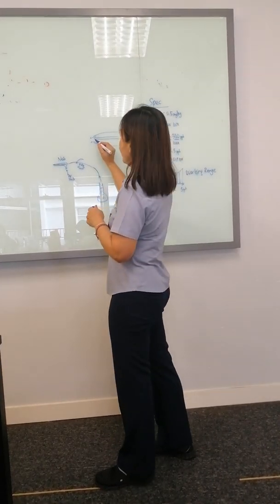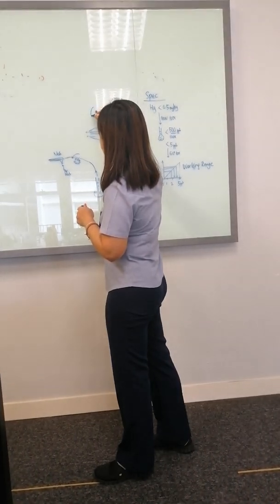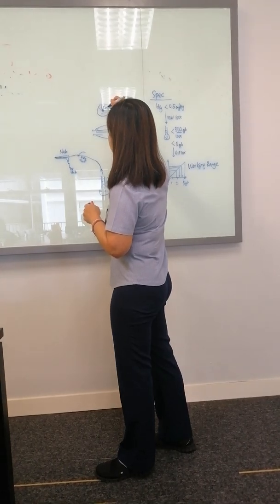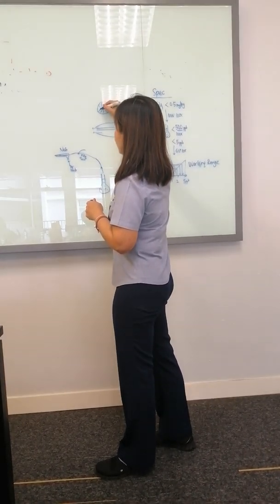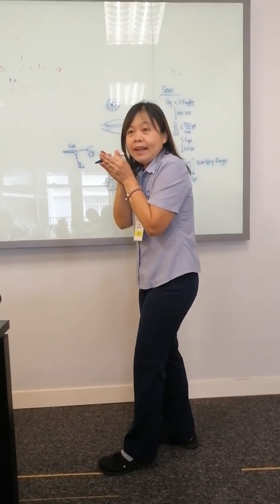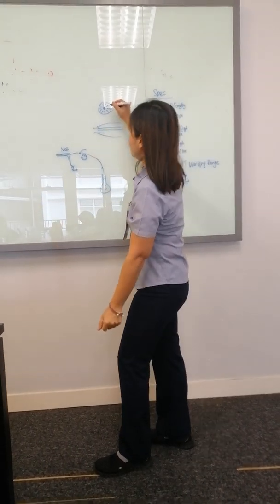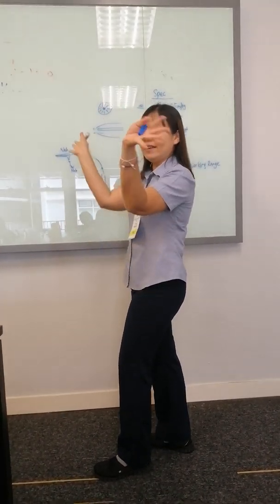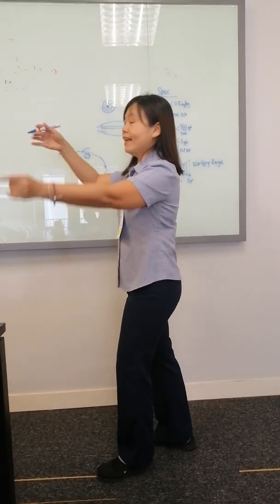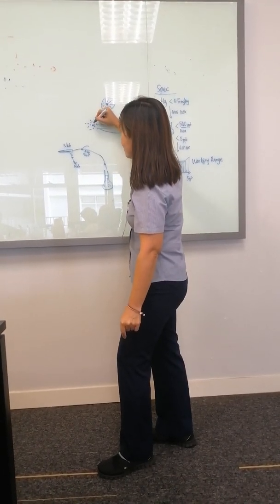So it's going to create a donut of low pressure. The sample is at the capillary, so argon gas is blowing outside of this ring. Yeah? So now this zone is going to be the low pressure zone. Now I am cramped in the capillary, so compact, but the outside layer is all low pressure. What happened? The liquid will be drawn 360 degrees. When the liquid is drawn 360 degrees and hit by the argon gas, then it comes out as aerosol. So this is how your nebulizer works.